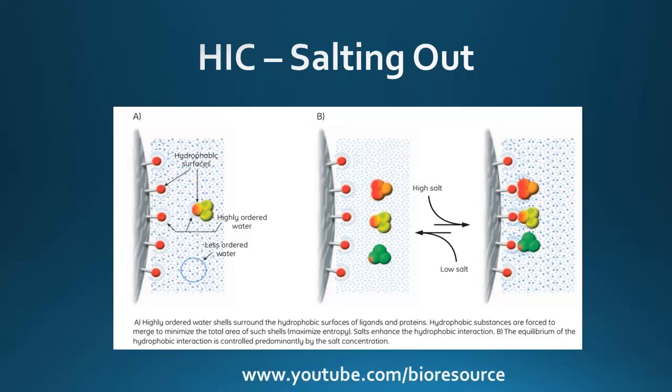Chaotropic agents disrupt the intermolecular forces between water molecules, allowing proteins and other macromolecules to dissolve more easily. Chaotropic agents interfere with stabilizing intermolecular interactions mediated by non-covalent forces such as hydrogen bonds, van der Waals forces, and hydrophobic effects.